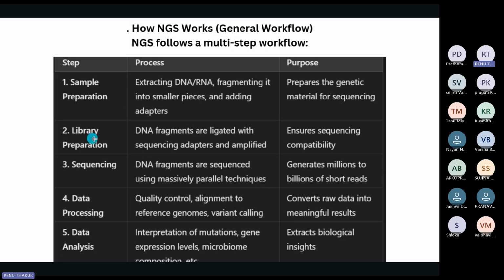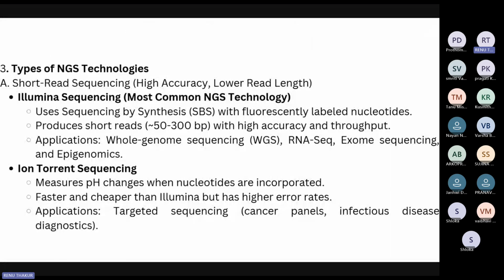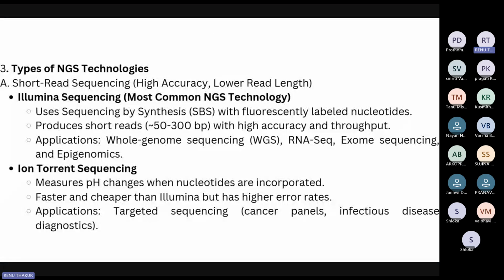The next step will be the library preparation. We have the DNA fragments and we are going to ligate them with adapters. I think you all will get confused, so I'll just go to the detailed workflow itself and then come back to this. First we look at the types of NGS technologies.